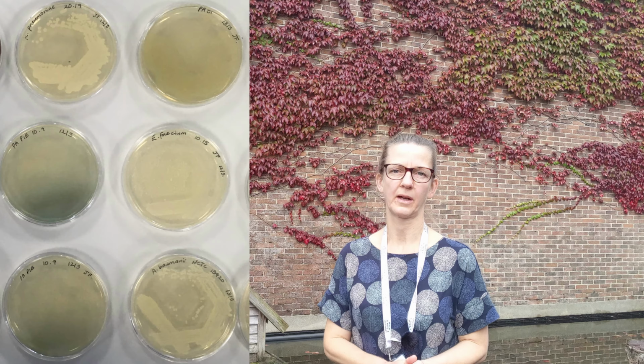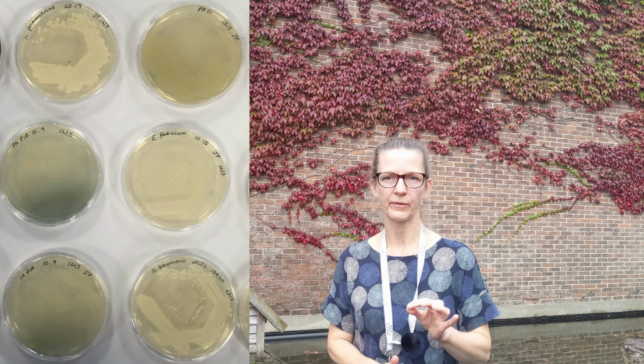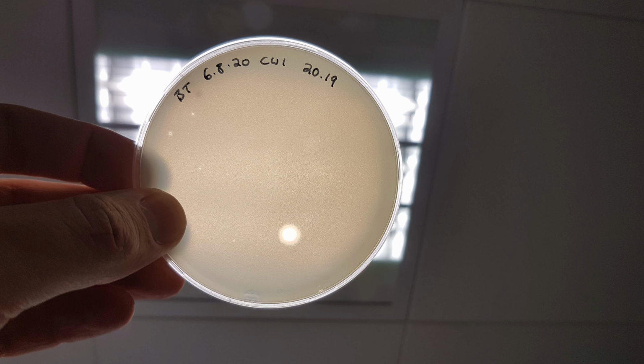So we'll prepare plates with a lawn of our bacteria, our host bacteria, and we add a small drop of our enriched filtrate to that, and if there's any phage there, they will infect the bacteria, cause them to burst, and you end up with a clear patch in your lawn of bacteria, so a clear zone where no bacteria have been able to grow.